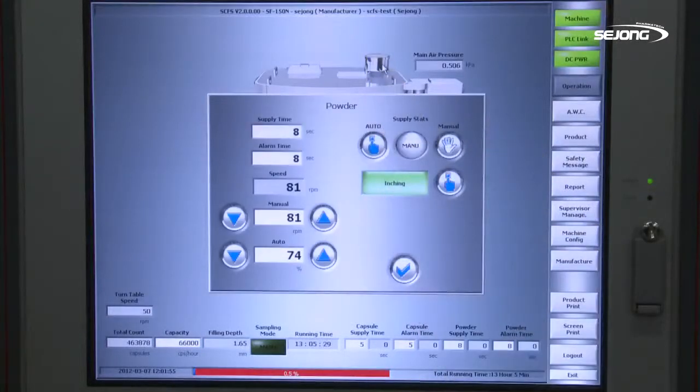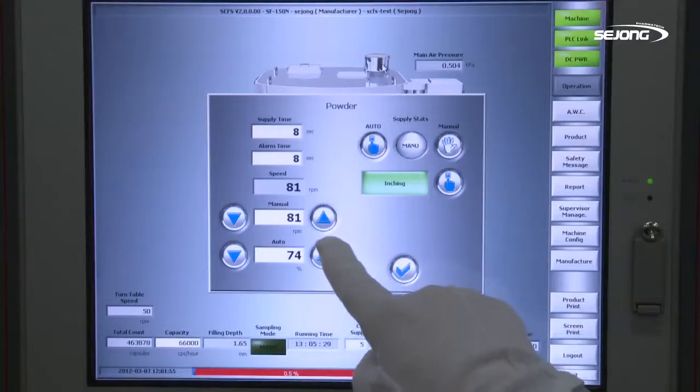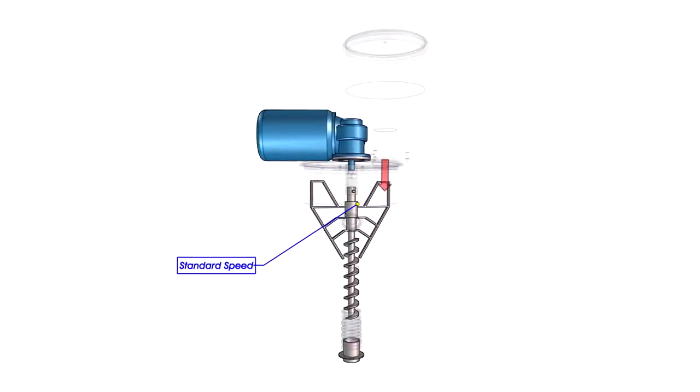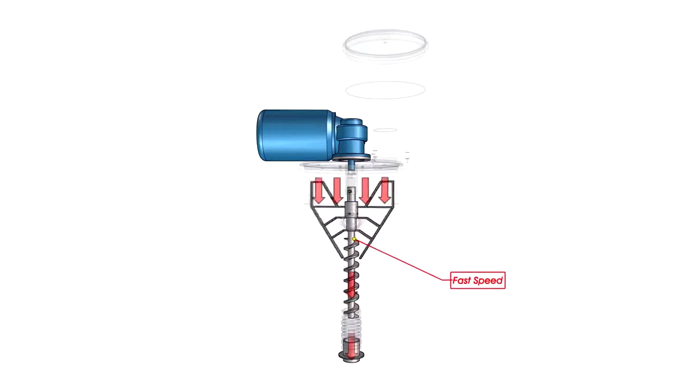Operator can adjust the powder screw through touch panel. Operator can adjust the amount of powder and speed up to supplying material.